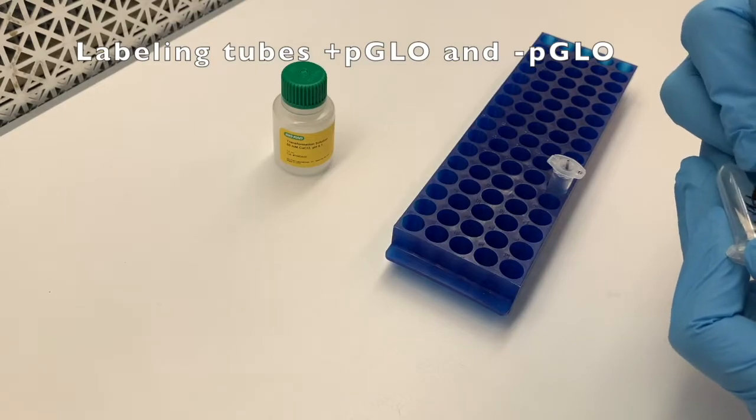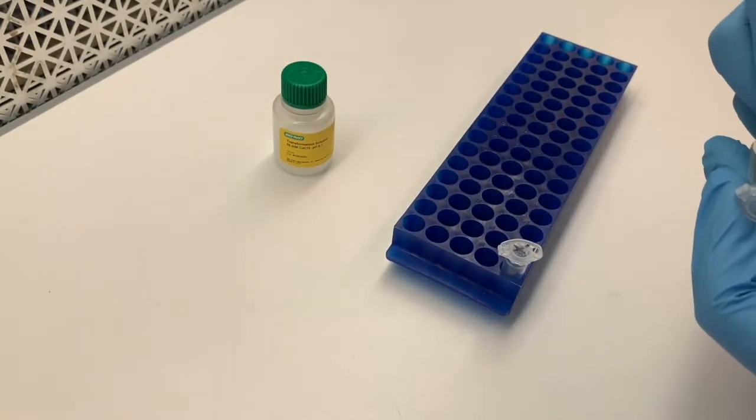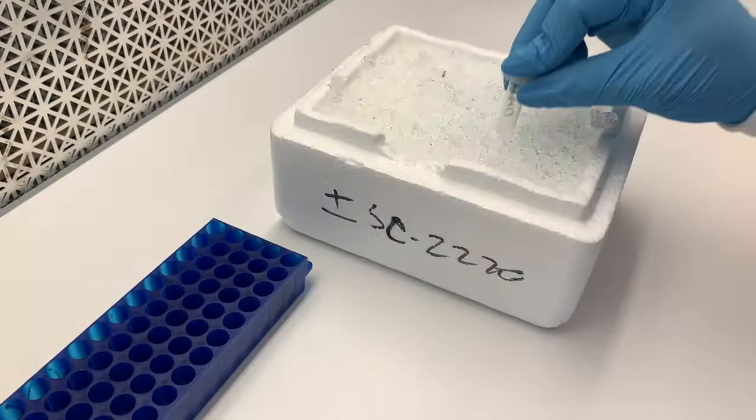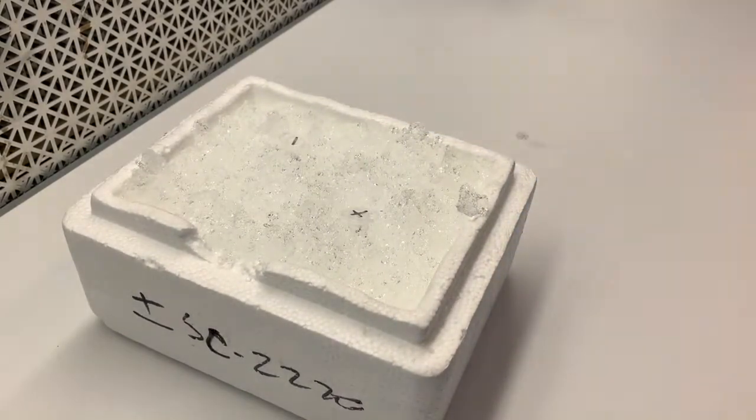You're also going to want to put calcium chloride solution in the tubes, using the micropipettor as you've done before. Then you're going to want to put those tubes on ice to get ready for the next step, so the solution will be cooled down.